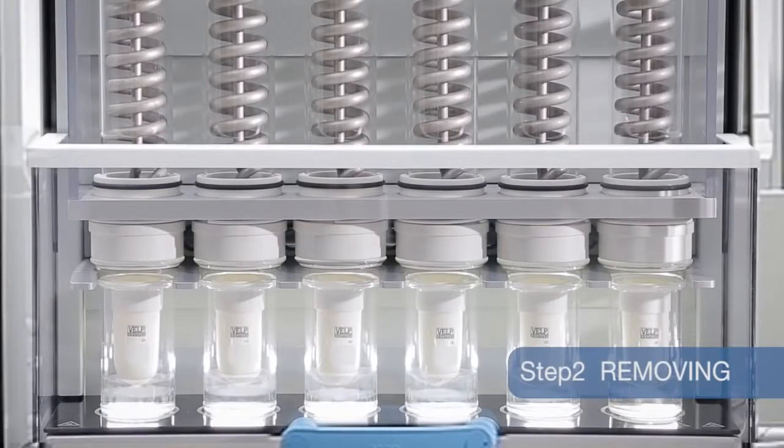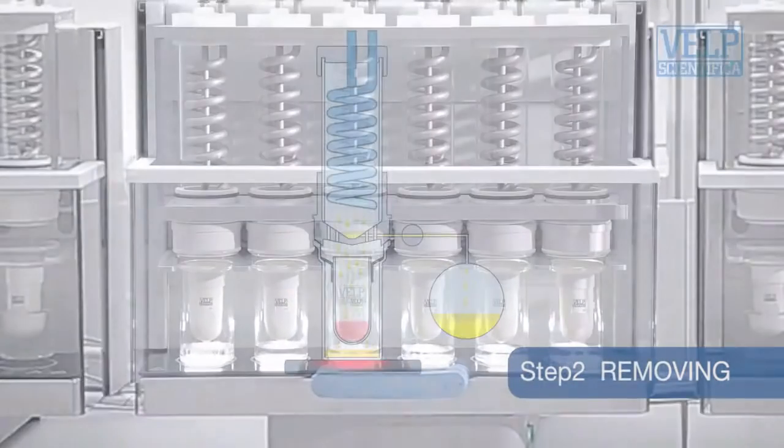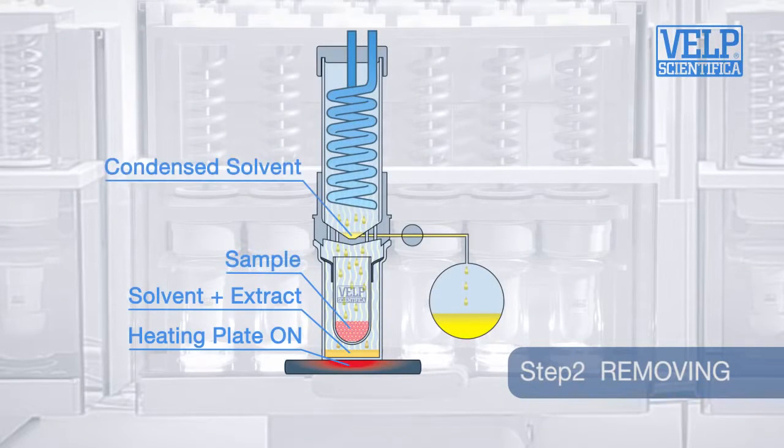The removing step automatically lowers the level of solvent to below the extraction thimble.